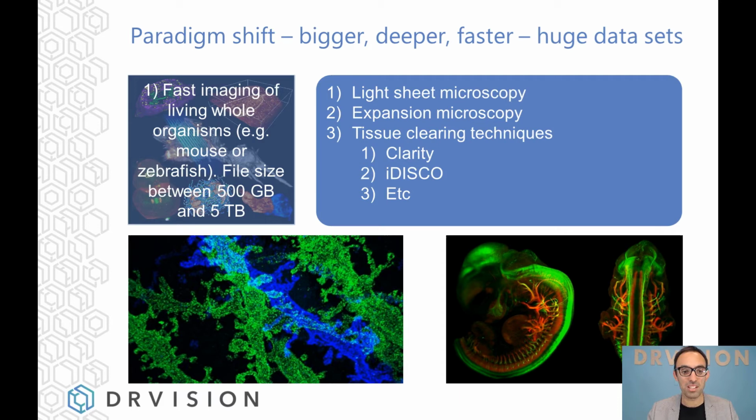The file sizes can be multi-terabyte for a long time lapse. It's never multi-terabyte for a single time point. That's an important distinction to make, because the volume rendering fails not because of the long time lapse. The long time lapse causes problems with memory management, but not really the volume rendering. We'll talk a bit more about this. Typically, the volume rendering fails if a single frame is bigger than RAM or bigger than the GPU. That's when it fails. Anyway, we'll go back to that.